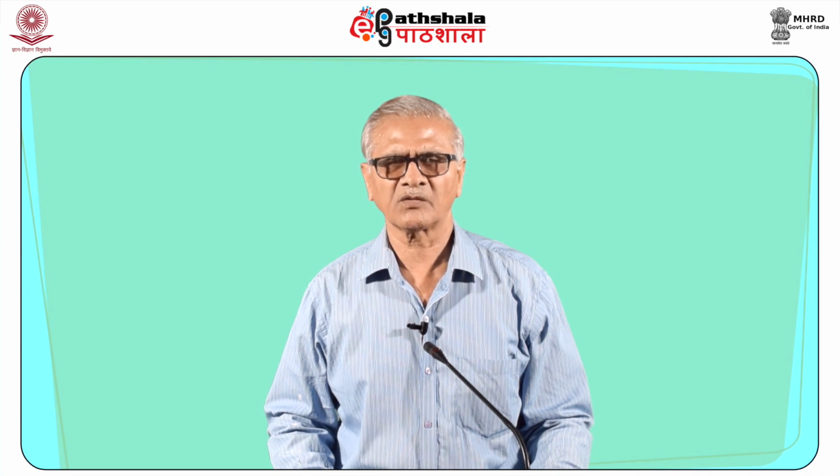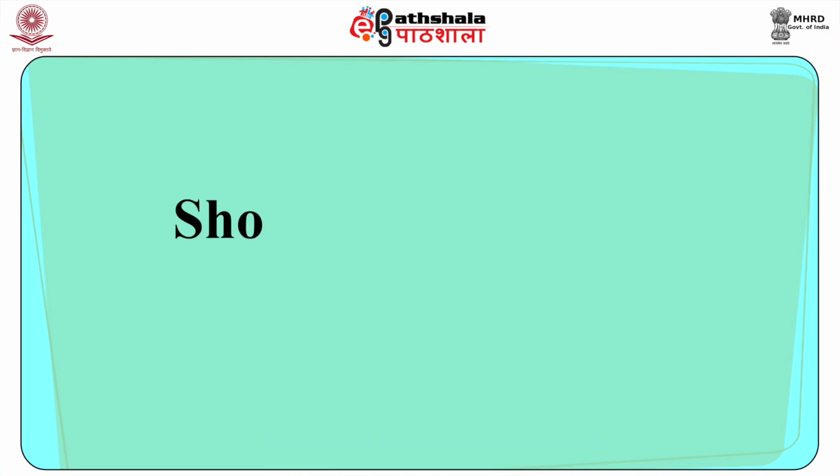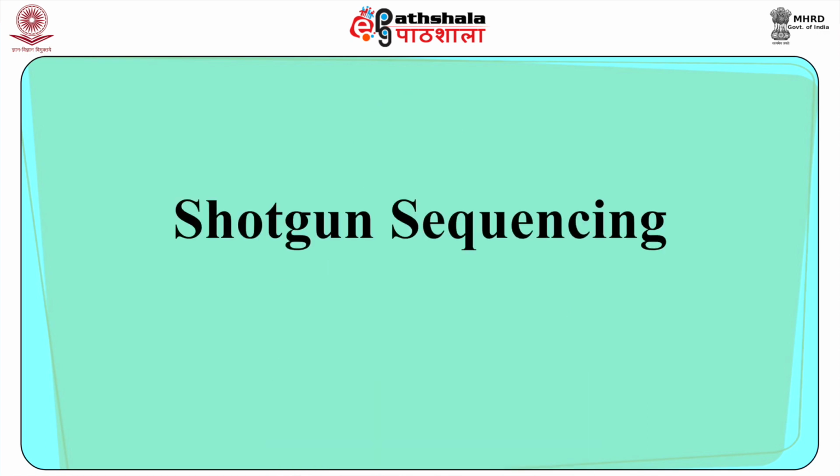A wide variety of next generation sequencing methods are available. Some of these sequencing methods will be discussed in this module. One of the methods of next generation sequencing is shotgun sequencing. Shotgun sequencing, also called shotgun cloning, is a technique used for sequencing long DNA strands. As the name suggests, the sequencing is analogous to the rapidly expanding quasi-random firing pattern of a shotgun.